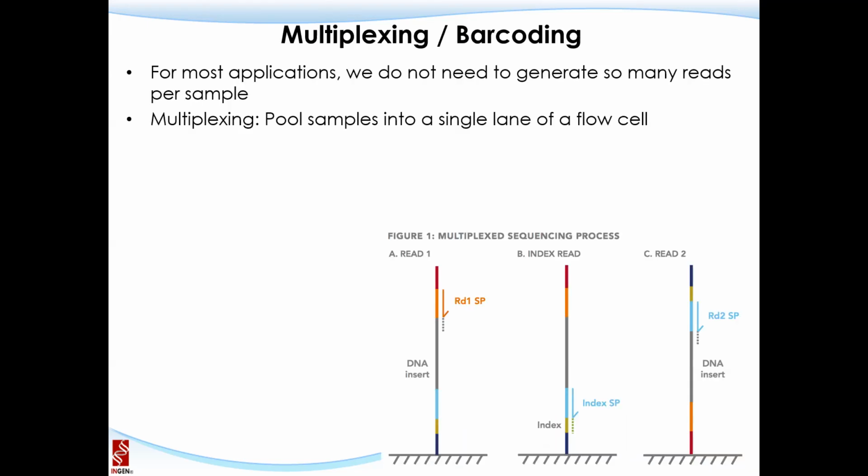Okay? So some of the very high level concepts, because I don't see that this is a concept that can fit in anywhere in the lecture, I decided to put here. So the first concept is super important. That is the barcoding or multiplexing.